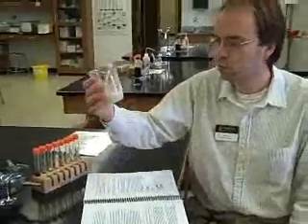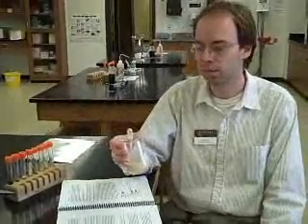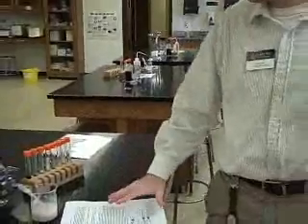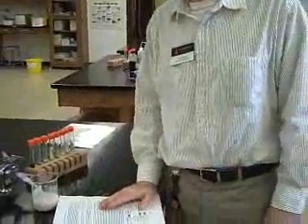Our experimental organism is yeast. Yeast is, of course, a fungus, and it can do both aerobic cellular respiration and also alcoholic fermentation. That's what makes it valuable for our experiment today. For our first experiment, exercise 8, demonstrating the effect of substrate type on carbon dioxide production by yeast, the idea is that there are certain kinds of sugars the yeast can use to do aerobic cellular respiration, certain kinds it can't. And our experiment found out some of the ones it can use and some of the ones it can't.